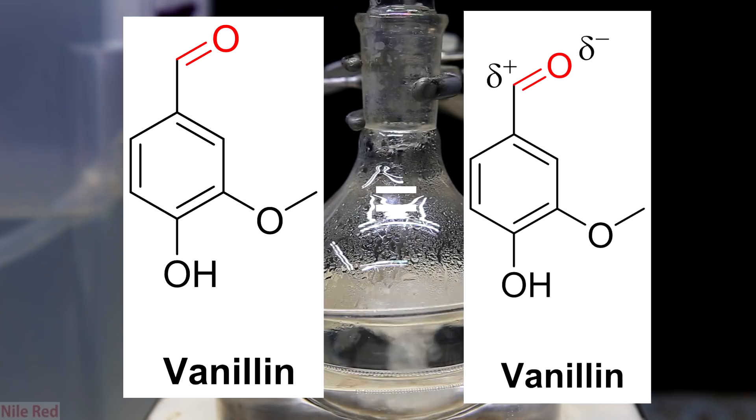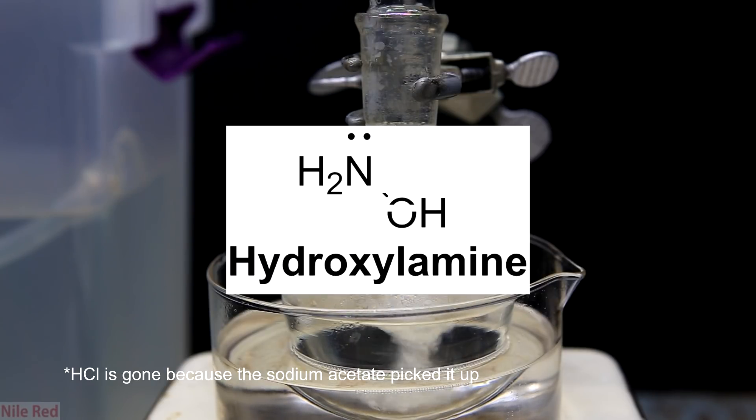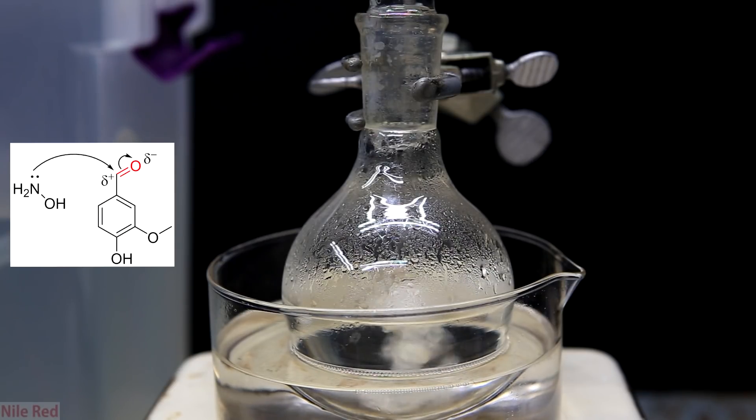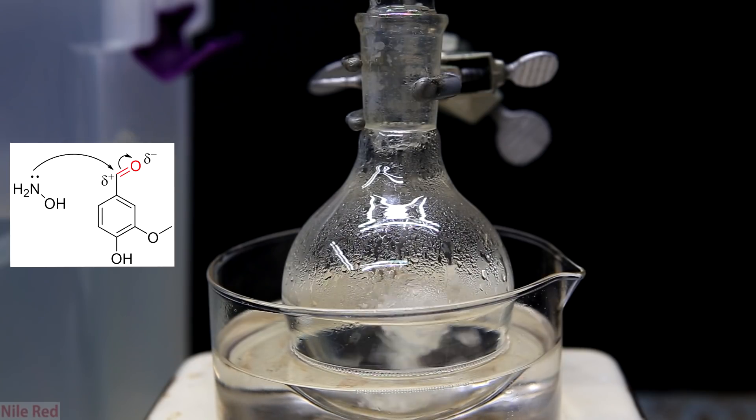Now we'll move over to the hydroxylamine and it's a lot simpler. The nitrogen basically has a lone pair of electrons that would like to be shared with something. This something is generally something that carries a positive charge or a partial positive and in our case we have our aldehyde. So what's going to happen is the lone pair of the nitrogen is going to attack the partial positive of the carbon in the aldehyde and form a bond.